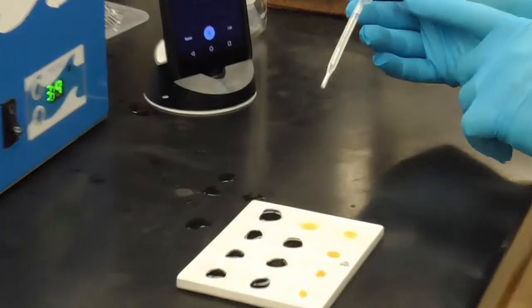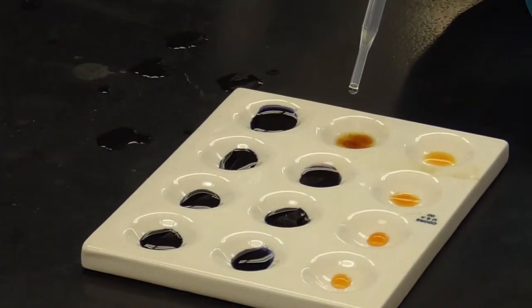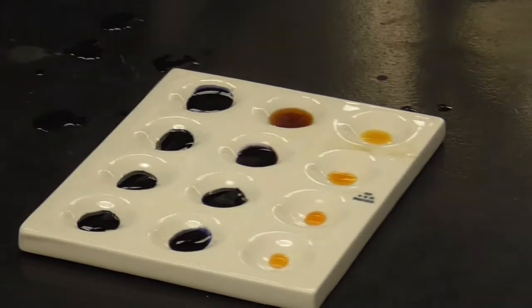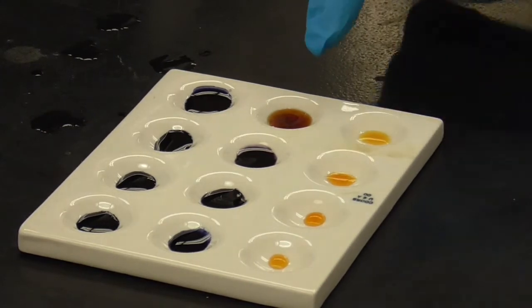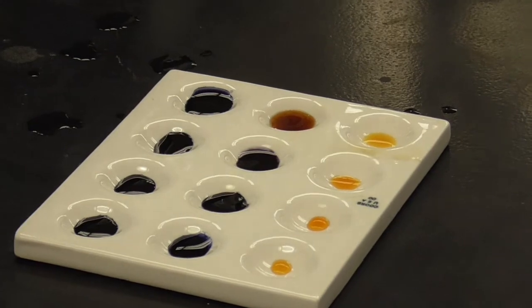Tube 4, where we put 6 drops of the enzyme. 1, see that color change? It's a little different, right? 2, 3, 4. So that's very interesting. Where we see that we put the most enzyme, it is causing that reaction to occur. It is causing that starch to break down. And we see the evidence of it by the color change.